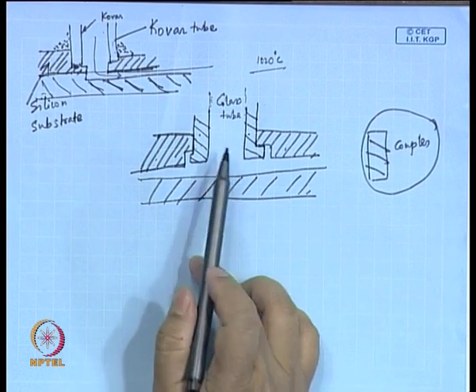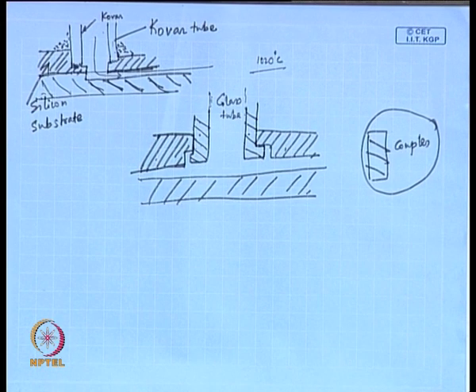So, once you apply the coupler, it would be similar to when we purchase a new pen, we see on the tip of the refill there is something, it would be a very similar one.